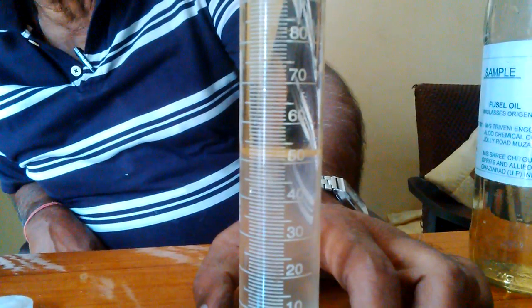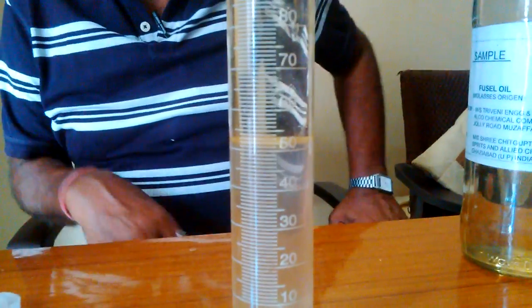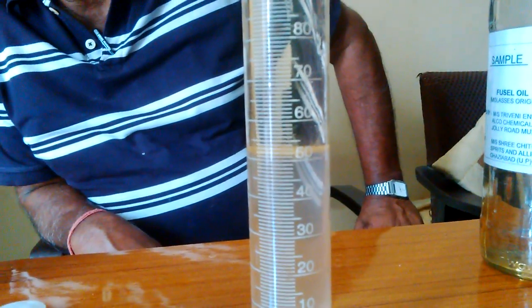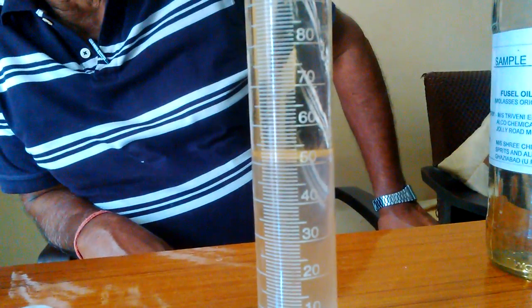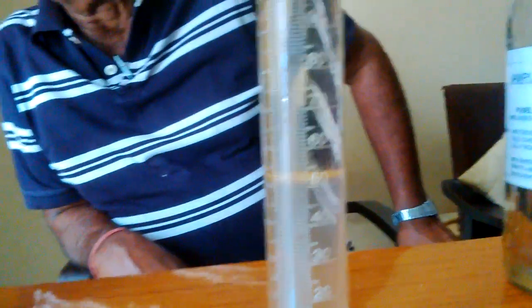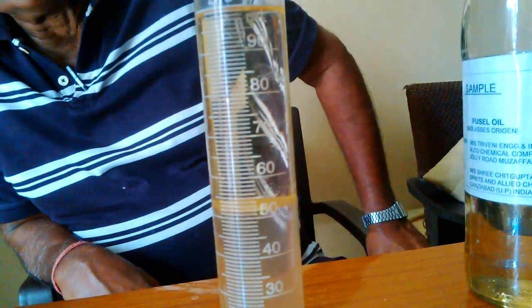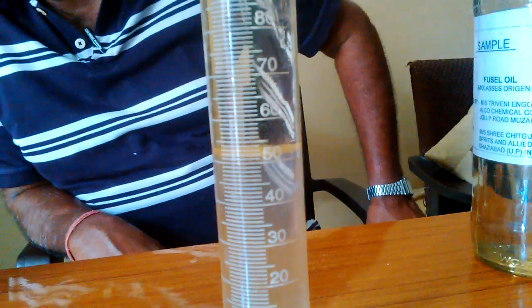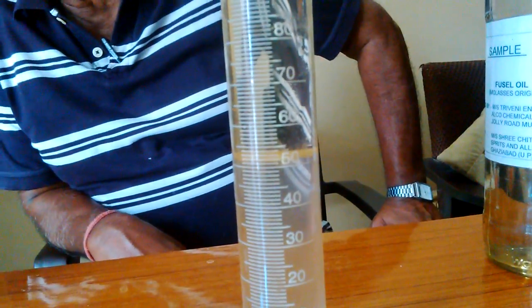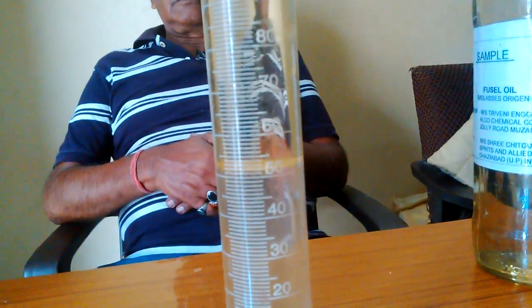Now we check the 100 ml cylinder. We find that the water and the fusel oil balance — the water layer reads at 52 percent and the fusel oil at 48 percent.